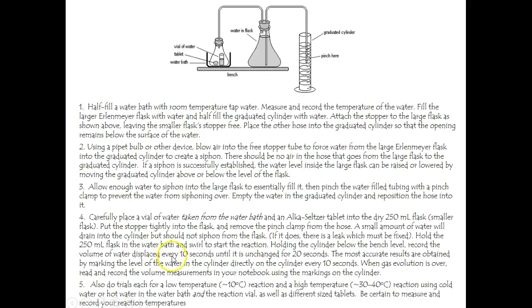Record the volume of the water displaced every 10 seconds. So you're going to get a rate. Somebody's going to count to 10 and you're going to say, 8 milliliters of water or 1 milliliter of water. And somebody shouts it out and you can dial it in, do it for as long as it takes until it's unchanged for 20 seconds. And then you'd just be wasting your time.